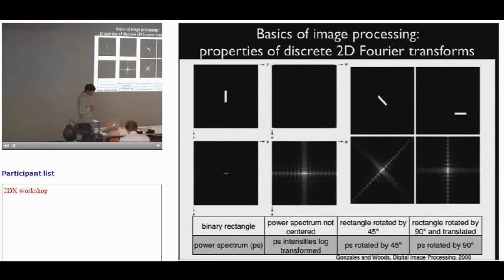Now let's move on to certain other test objects. One of them is this binary rectangle, and I find this useful because you can use these very simple images as a repertoire to understand your obviously much more complex images. But these are the fundamental rules of it.